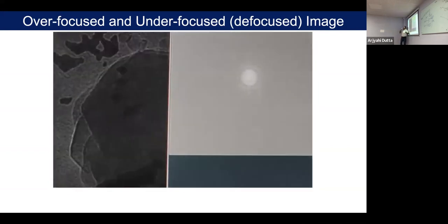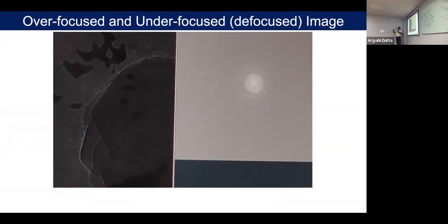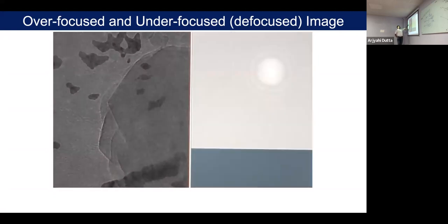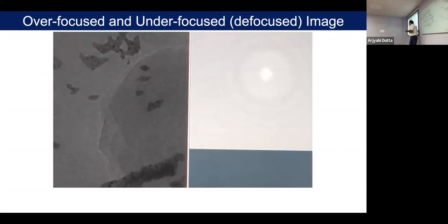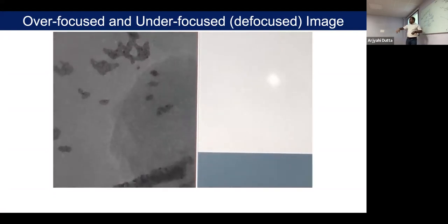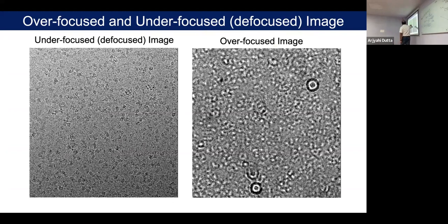That is the reason I'm saying that whenever we talk about an object being in focus, it is either over focused or under focused. It is not the actual focus. So we have to consider what kind of focus we want, an over focused image or an under focused image. If you consider that those are my protein molecules, and something is under focused and something is over focused, the same thing looks different.